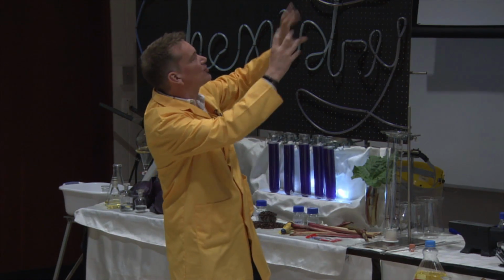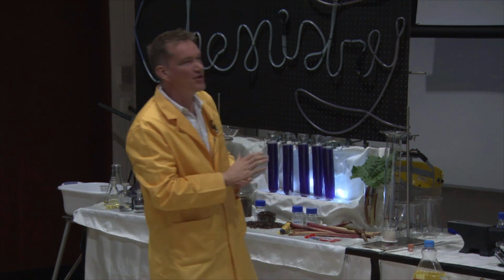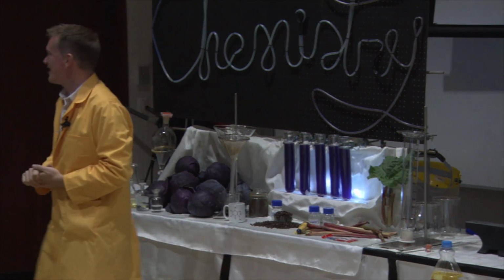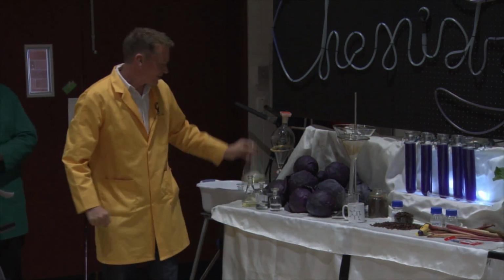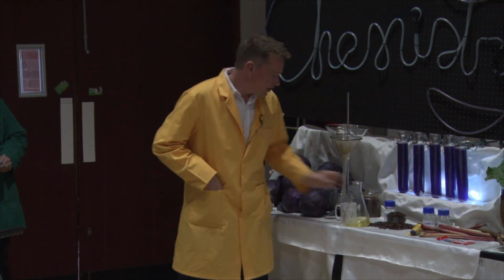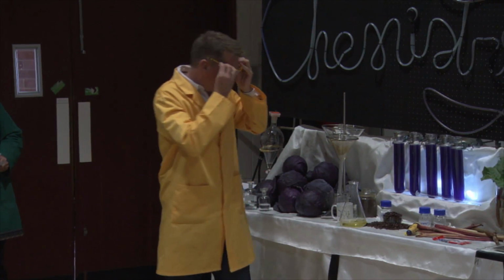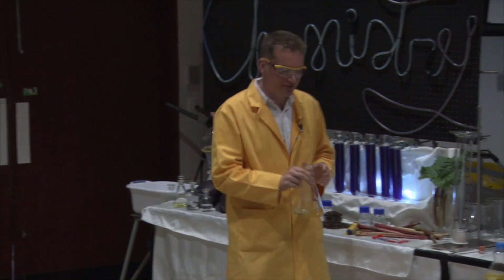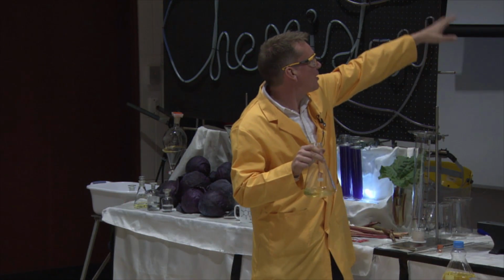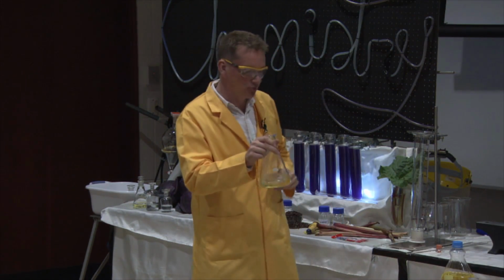But we've reacted those two together, okay, and we've made a new compound. Well, actually, I say we, but Craig has done this, and Craig is standing over here. He spent all day doing this. So we've dissolved this in a solvent, and this is what we've got here. So this is our vanillin combined with the oxalic acid. Okay, we've dissolved it in a solvent, and this solvent is called ethyl ethanoate, and that's the one right in the bottom corner there.